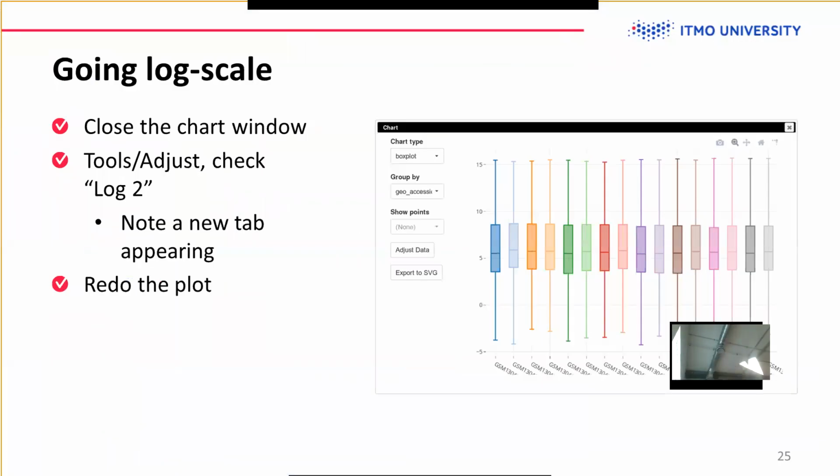It should look like this, right? So now it actually looks like a normal distribution, more or less, as much as you can guess from a box plot. You have a heavy part in the middle and well-limited tails, which is pretty nice.